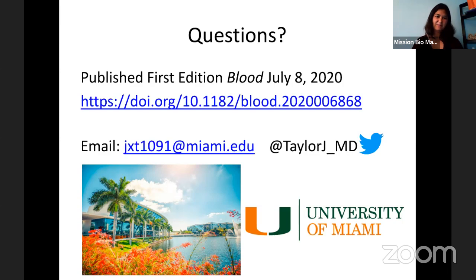Yeah, I was really excited when I read that in your paper, because I think from other Mission Bio Tapestry papers, they've been finding that mutations are occurring in epigenetic factors prior to signaling pathways, and now you found splicing factors, so it very much supports Kathy Smith and Ross Levine's findings.